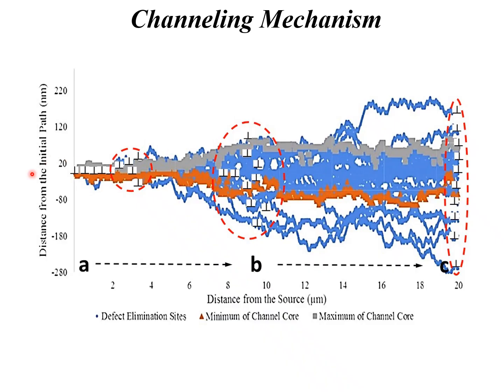So slip alone, shear on one plane, does not change the tilt, but shear with climb can create essentially either tight subgrain boundaries or diffuse subgrain boundaries, and you end up with some tilt to the crystal. The only other way to create a tilt in a crystal from one single slip plane operating without climb, let's say we're just looking at these dislocations, is if you have a barrier and some constraints so that you end up with some elastic bending of the crystal.